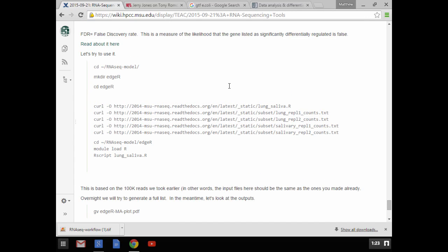All of that being said, and all of the work that I had you do this morning, we are going to pretend you did again, and we're going to copy and paste all of this to grab all of that data pre-calculated from somewhere else and put it into a new directory and do some of the work.